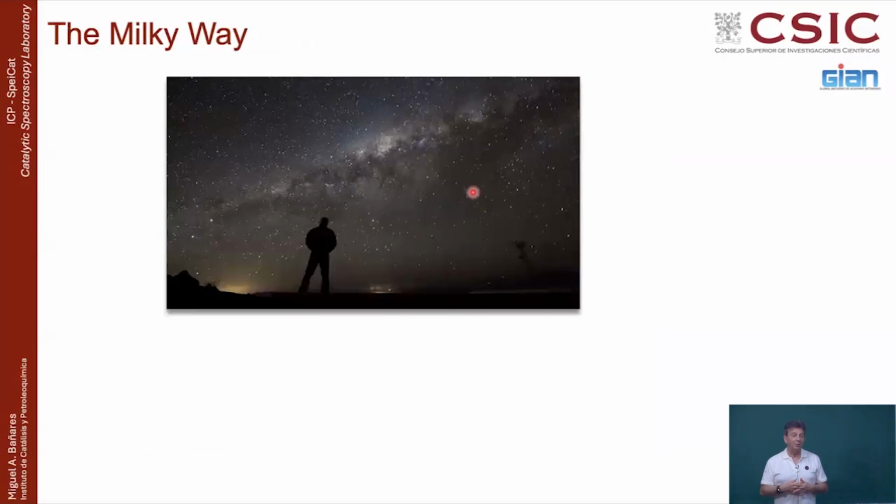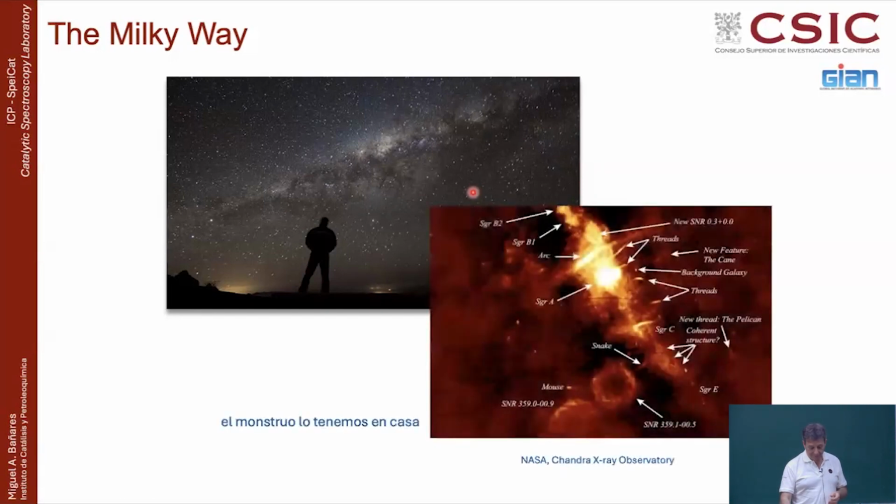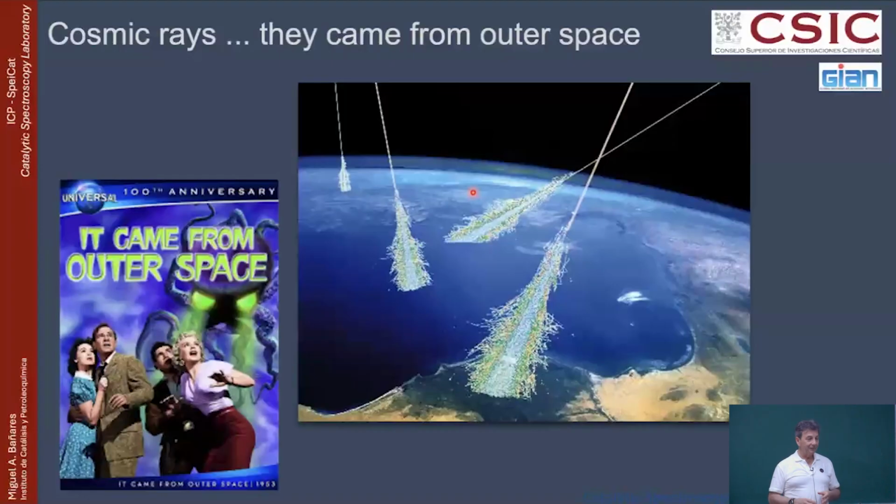Do we have any problem in Raman coming from space, apart from Andromeda or black holes and things like that? Yes, we have something that came from space, and these are the cosmic rays. Do you know what a cosmic ray is? Typically they are nuclei, protons and neutrons coming into the atmosphere continuously.